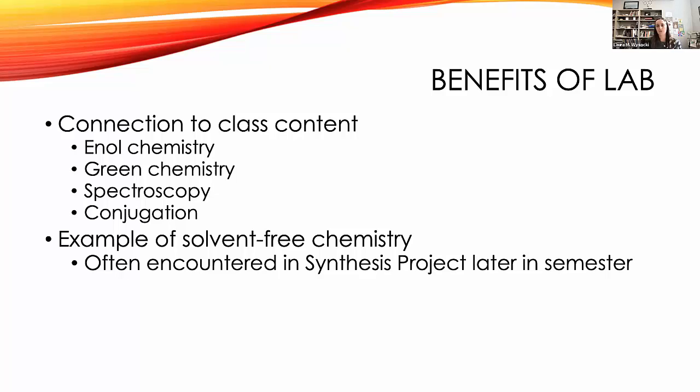And many of the procedures that they find end up being solvent-free reactions, either melts like the one they see here, or even just solid phase grinding. And so having them encounter that in the sort of training before the synthesis project that they develop is really helpful for them to get that experience.